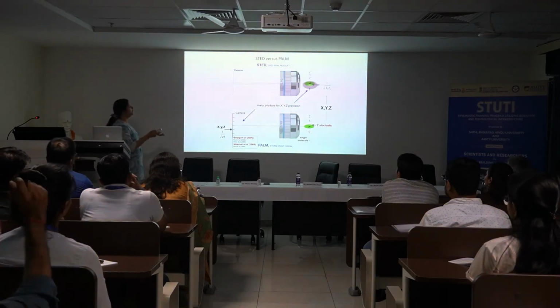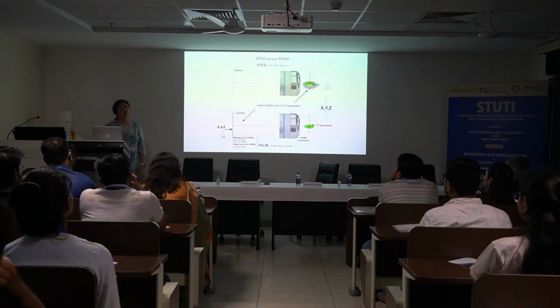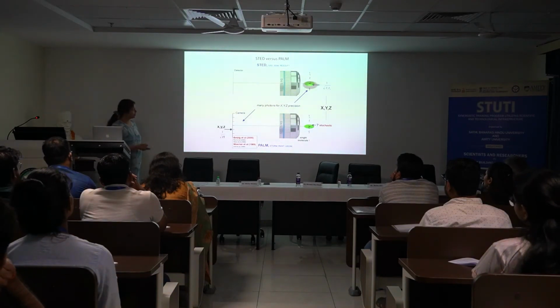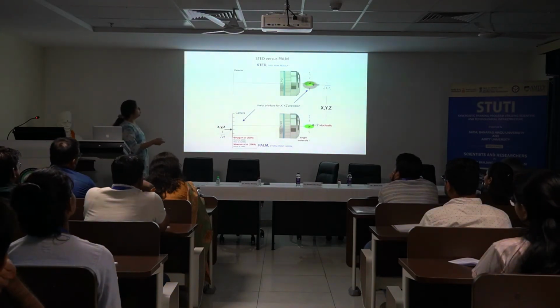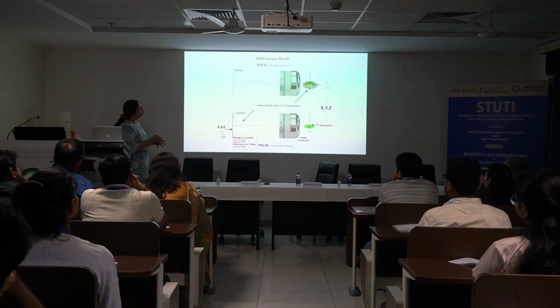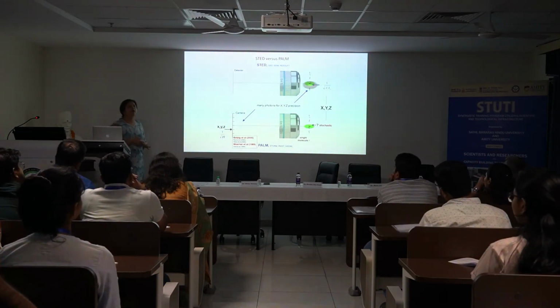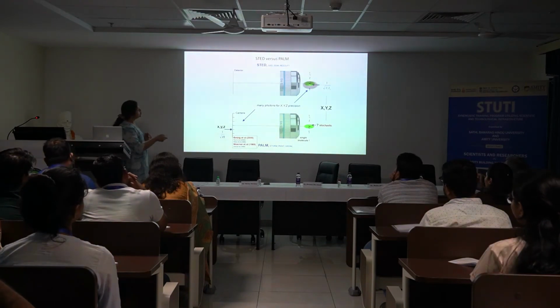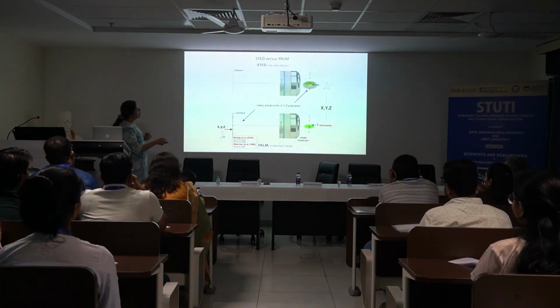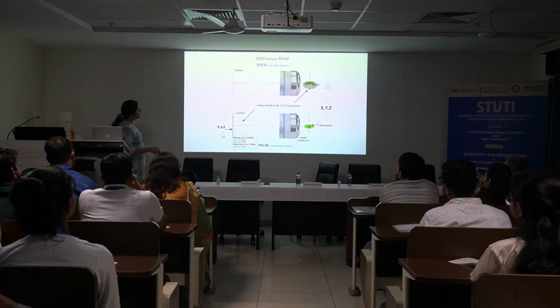So just in thinking about the 2 methods, at the end I thought I'll just bring these 2 slides. These are a part of Stefan Hell's Nobel lecture actually. And so what these methods are trying to do is essentially look at 2 states, an off state and an on state, right? And then instead, it is trying to come up with an on-state in a very, very precise region. In the case of PALM, it is trying to come up with an on-state of few molecules.